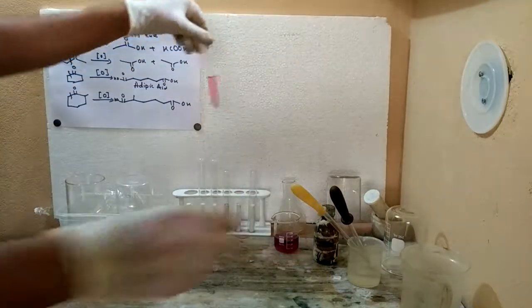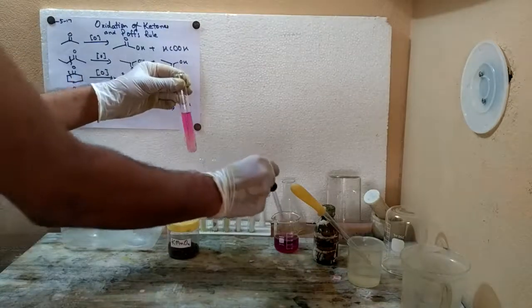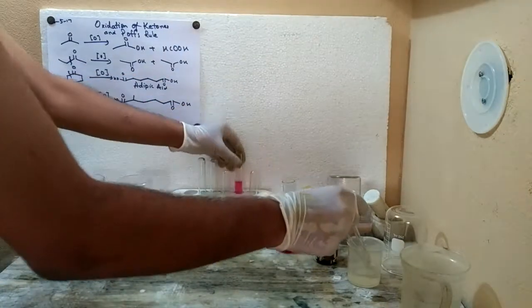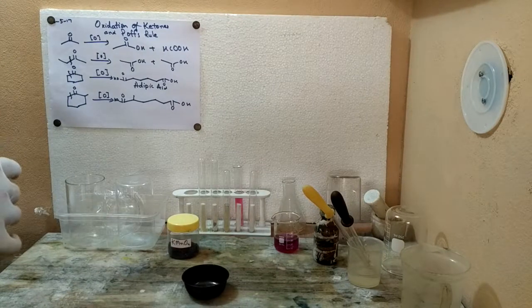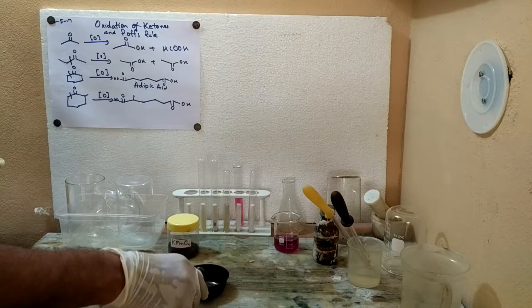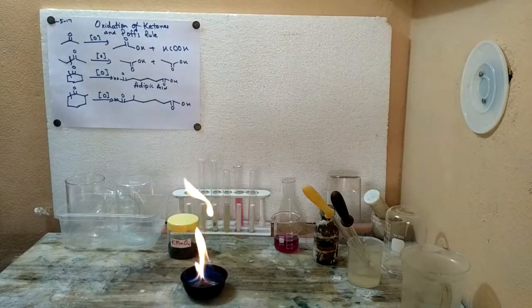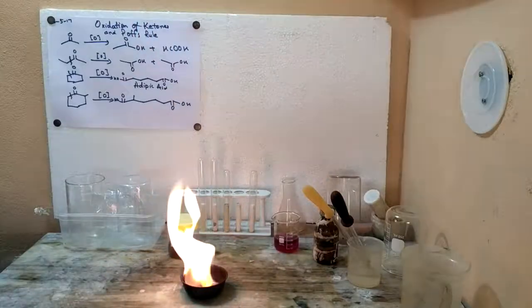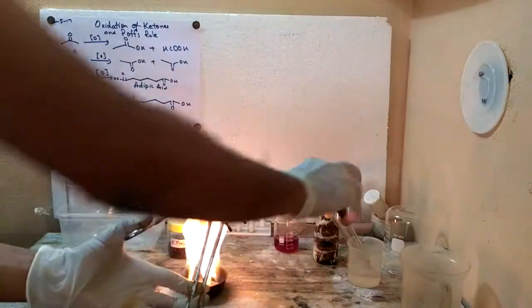Unfortunately, I don't have a Bunsen burner, so I will be using my homemade burner, which is very simple to construct. All that you need is a crucible and a flammable. In this case, it is acetone. You can also use some medical spirit or ethyl alcohol, or some diethyl ether. Anything works fine. Hold the test tube with the holder and face the test tube away from your face.